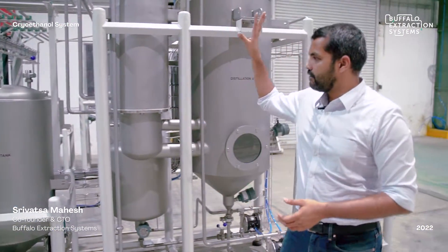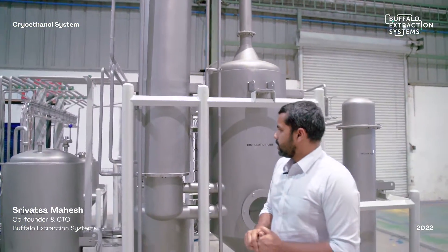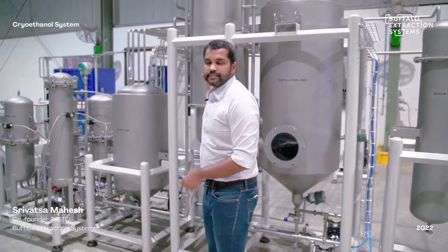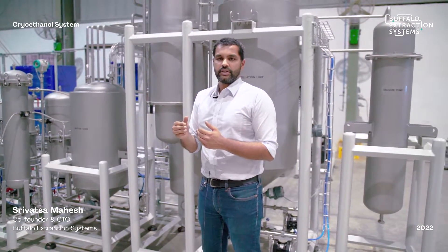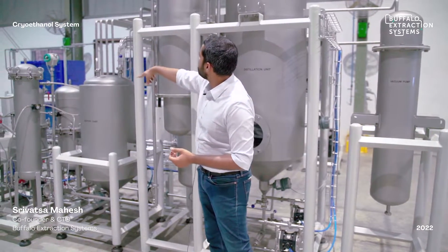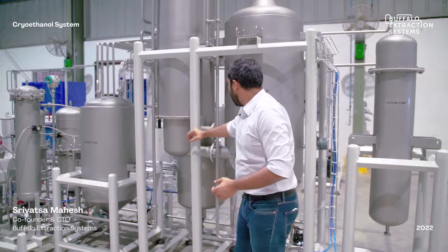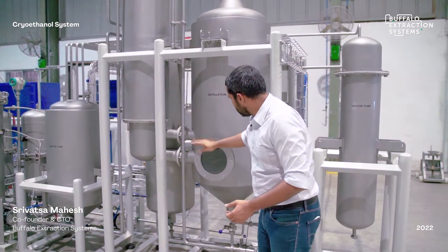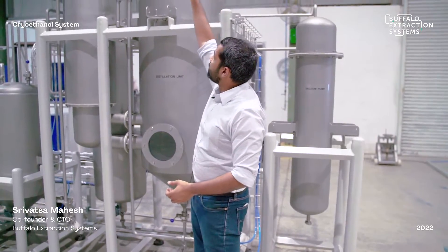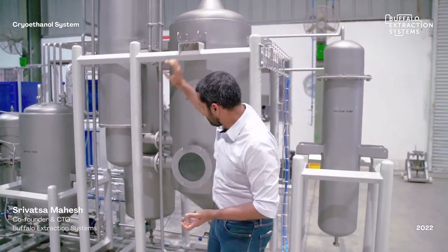After the buffer tank is the solvent recovery system, which operates as a falling film evaporator with a calandria. The ethanol-oil mixture enters the calandria from the top; combined heating and applied vacuum reduce the ethanol's boiling point and drive evaporation. The evaporated ethanol transfers into a vapour drum while the oil, being liquid, settles at the bottom. The vapour drum connects back to the calandria, where a chilling process condenses the ethanol and collects it in a tank.